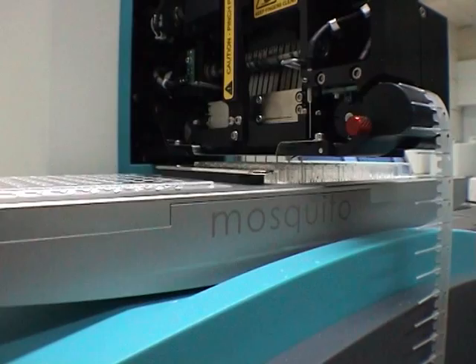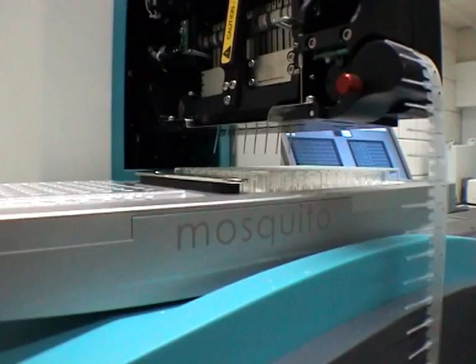As well as allowing very small volumes to be manipulated, the robot also accelerates the preparation of drops, thus permitting the number reached to be several hundred, if not thousands more during the initial screen.